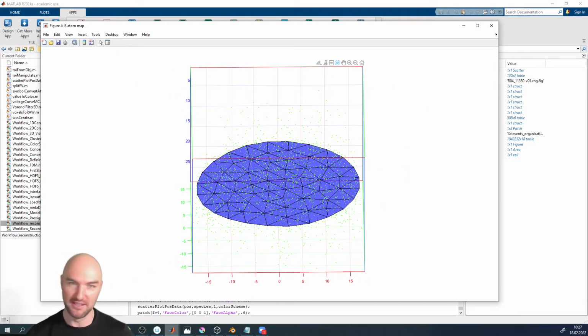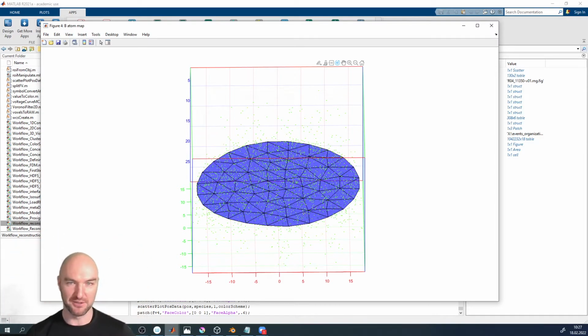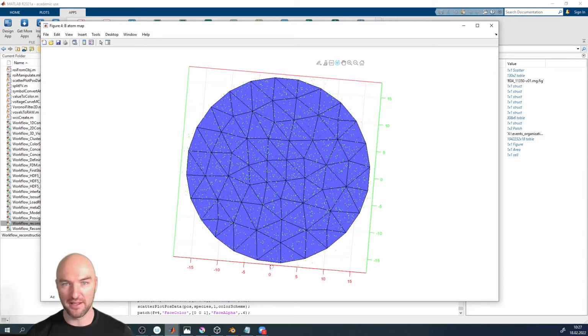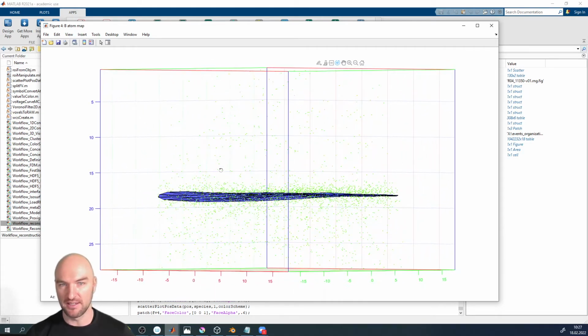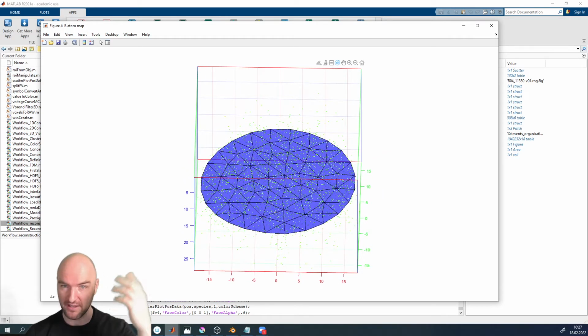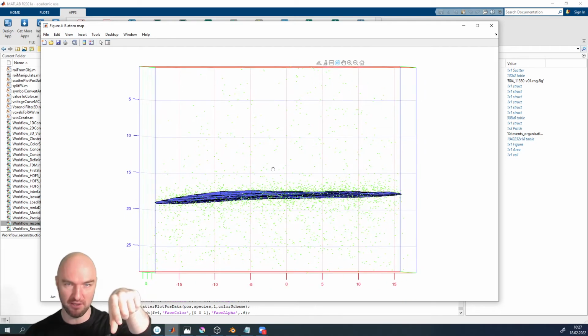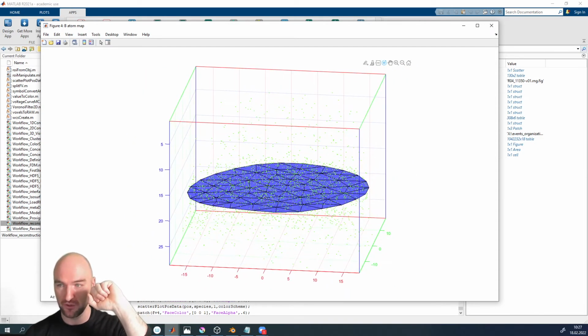It goes very quick. Go into Blender, rough outline, cookie cutter, punch it out, then move back into MATLAB, stretch it to the boundary. Redistribute the vertices if you need to. If you want, snap the vertices to the atomic positions, if you've got some segregation where you can do that. Sometimes you don't have segregation or not a lot of segregation. Then you're probably bound to doing most of it manually.